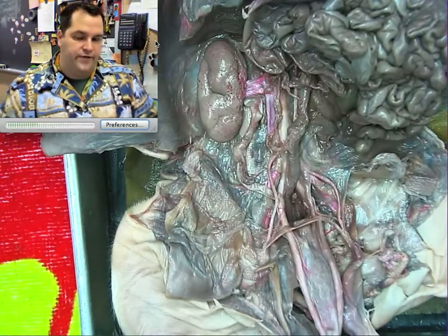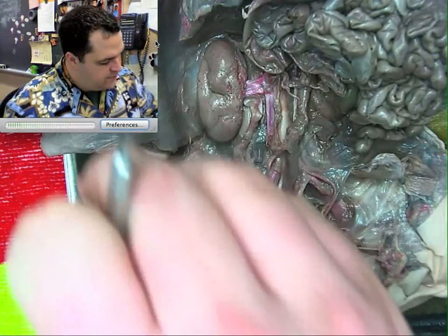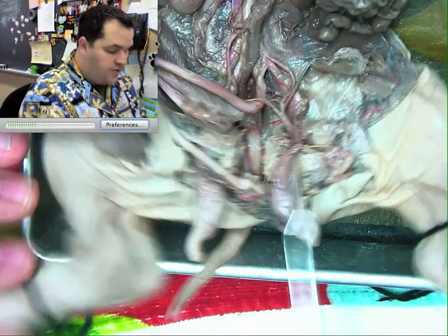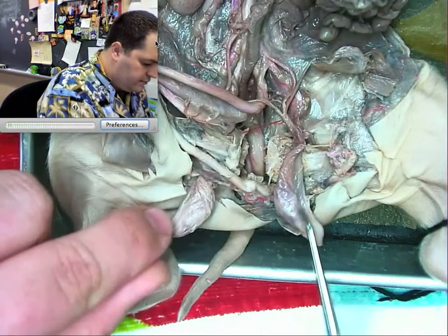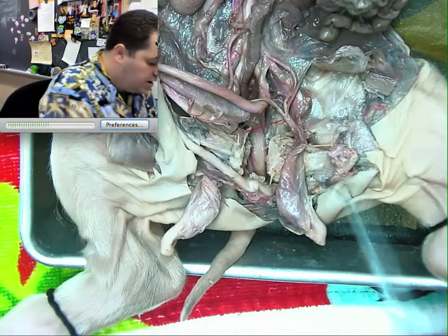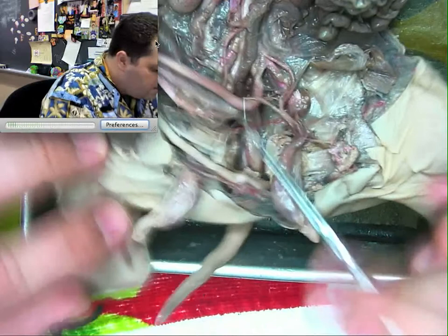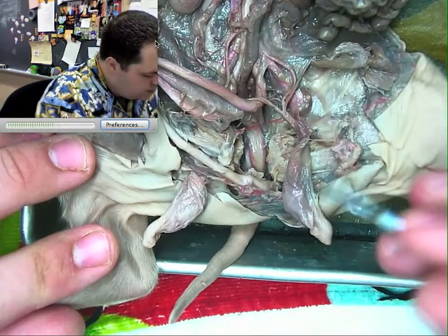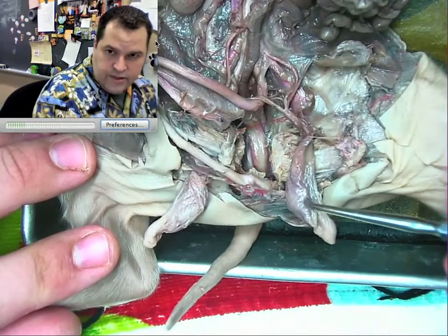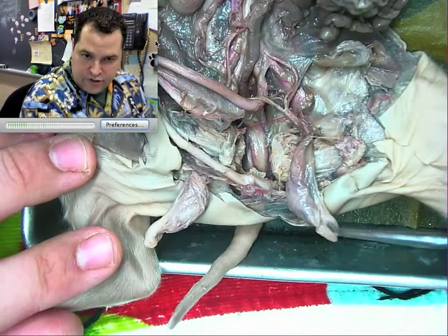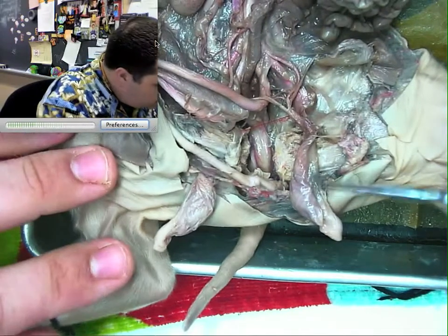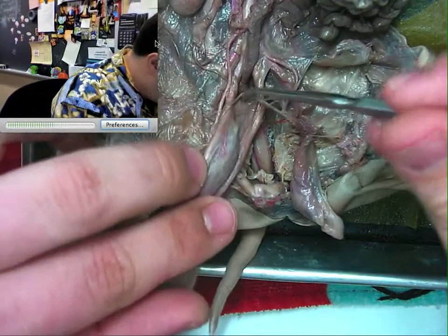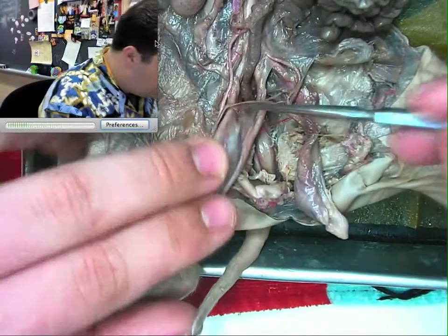Now we're going to get into some very specific male structures. I've moved the umbilical peninsula out of the way and actually split the hip line. The testes are more ventral — I've isolated them here and here. This structure is the testis, and this paler structure is the epididymis. Sperm will travel through the vas deferens and then meet the urethra at the base of the bladder.